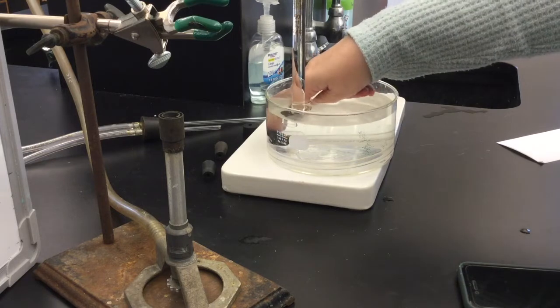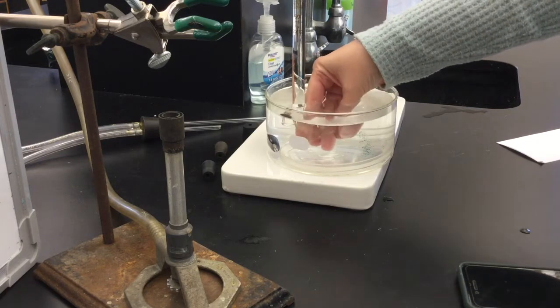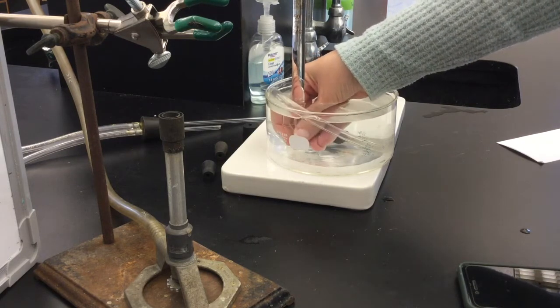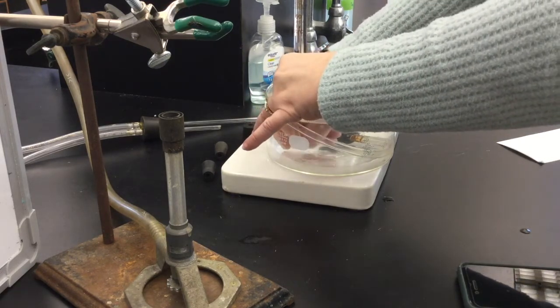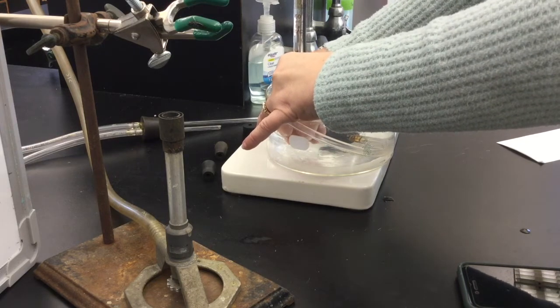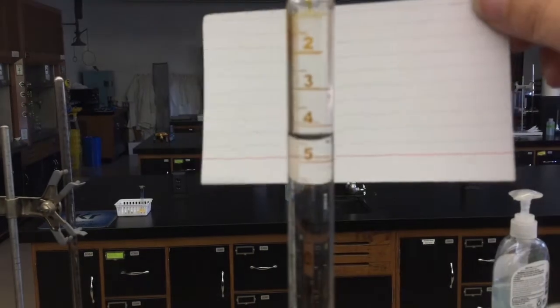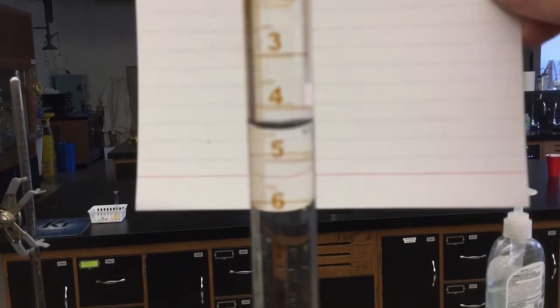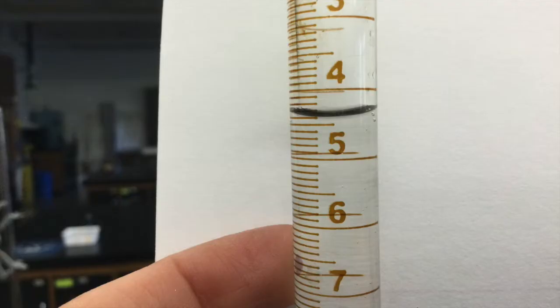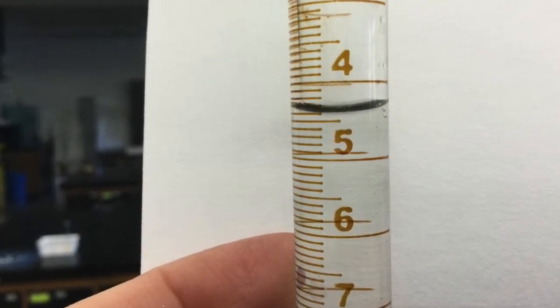Then without lifting the tube out of the water, making sure that it stays under the water the whole time, take the end of the tube that is not a stopper, so it's just the plastic tubing and nothing else, and push about 2 inches into the eudiometer. You will need to take an initial reading off of your eudiometer. It may be helpful to have a white card or paper behind the eudiometer so that you can better read the numbers. Remember to read at eye level and record this in your notebook.